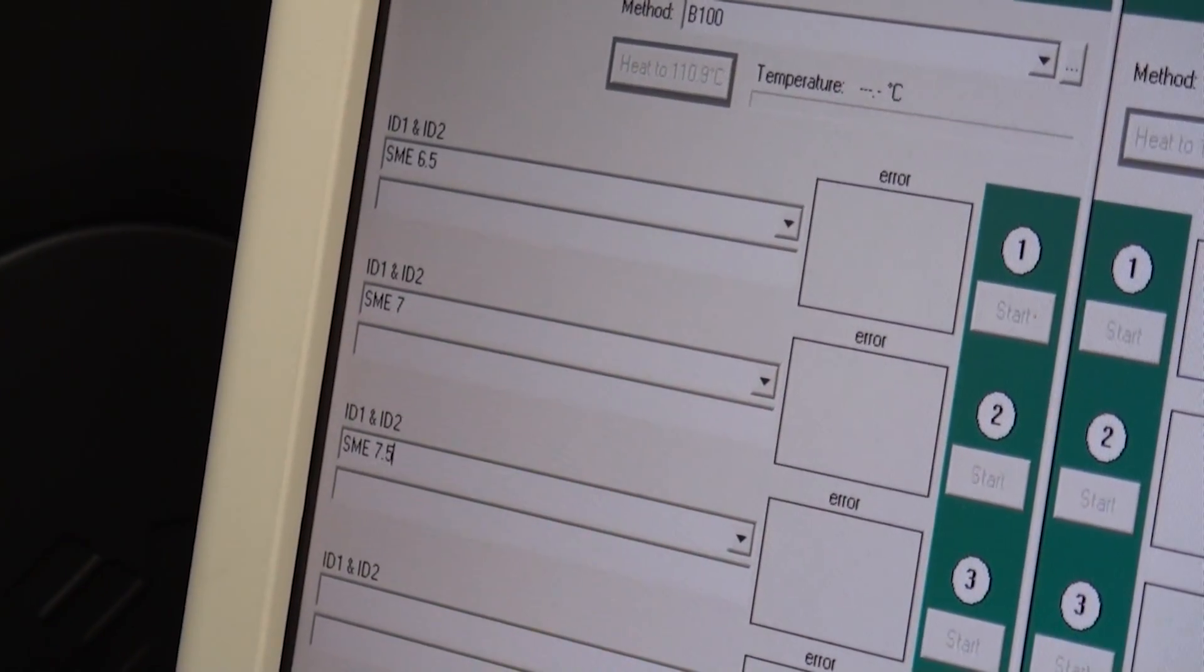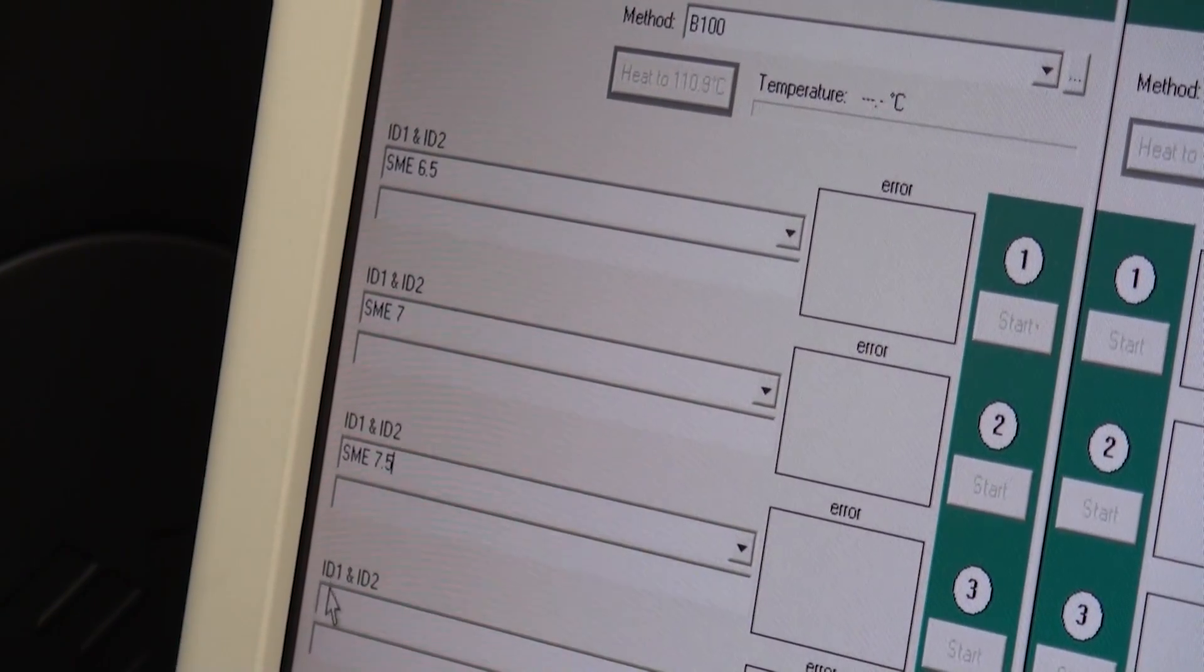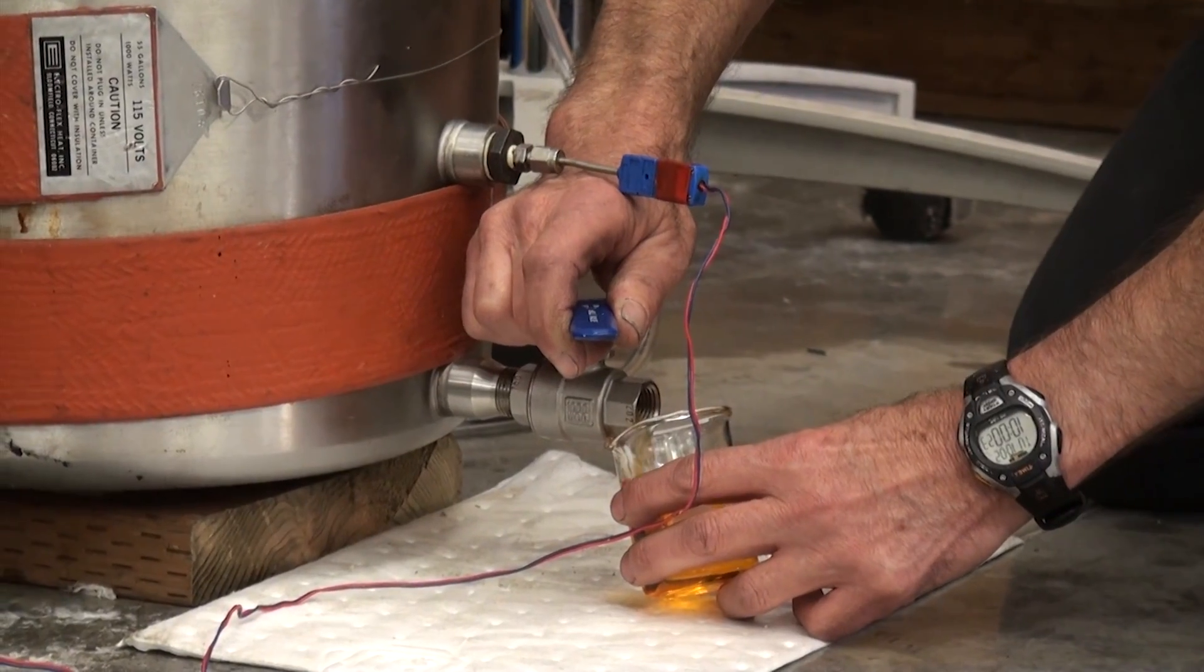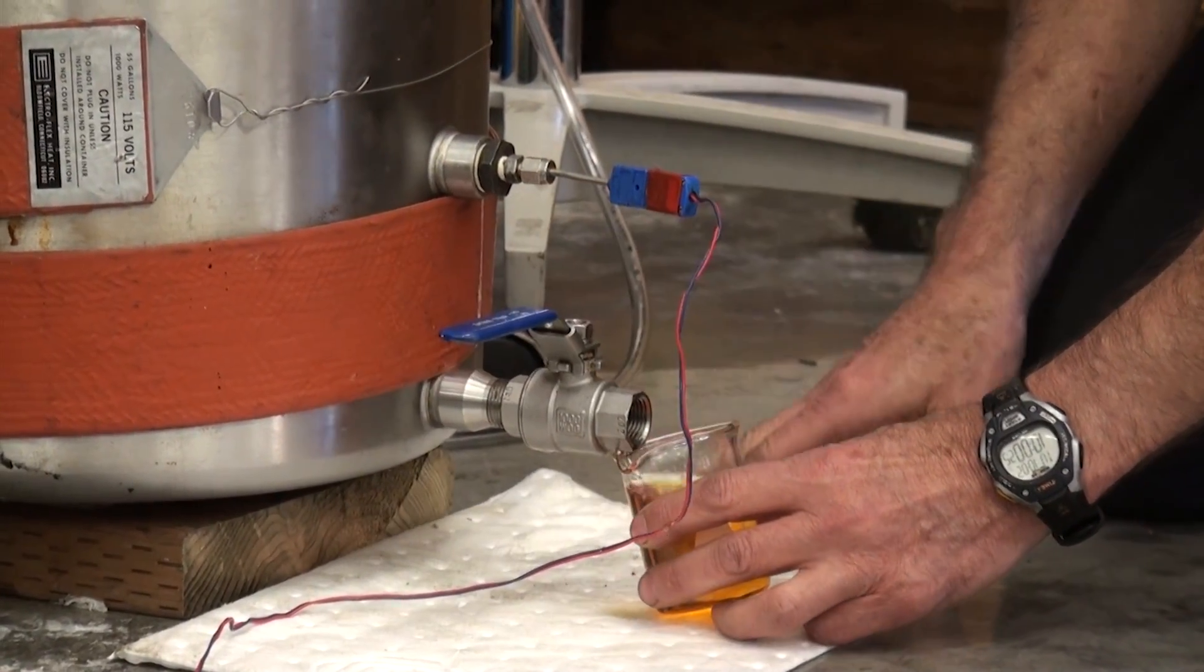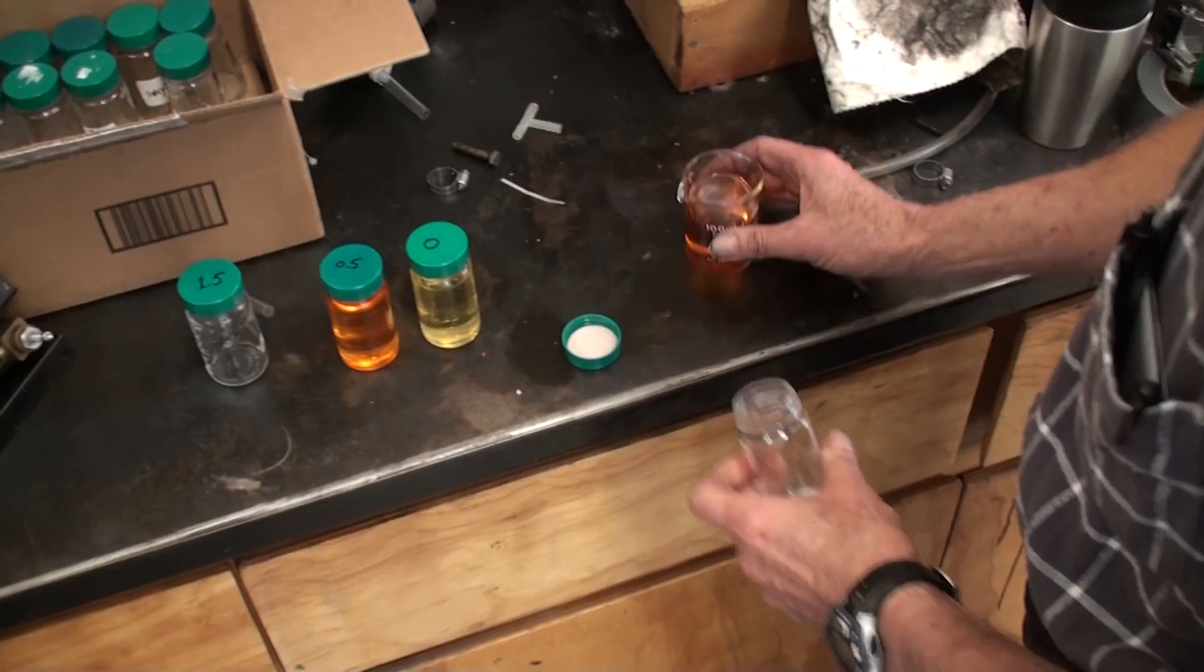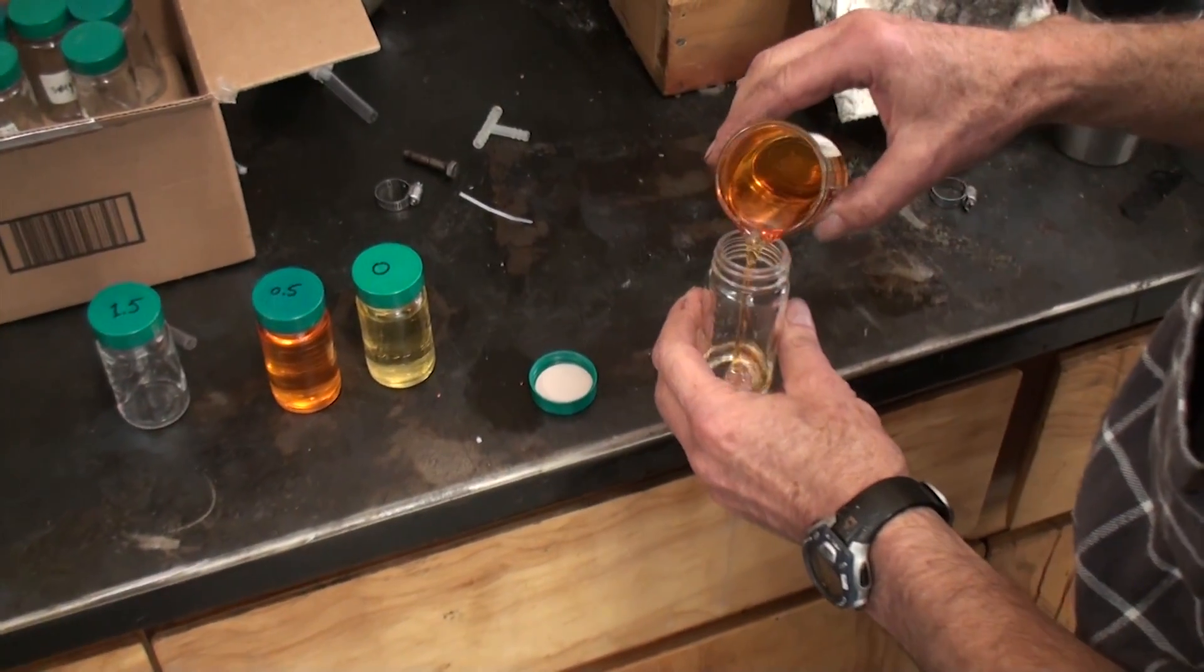The actual spec is three hours, and if you have biodiesel that's fresh and you get at least three hours out of your rancimat reading, then you're pretty good to go with your fuel stored for at least six months, probably longer.